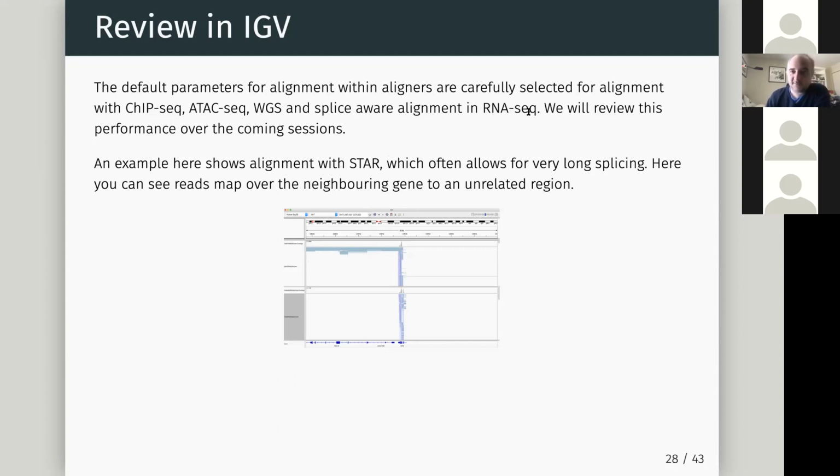So we could probably look a little bit more at this, in comparisons. But in this case, what we would say is that these 200 reads, we wouldn't count them anyway, because we're not sure what gene they belong to. So they get thrown away at a later point. And that's really what that paper I point to is going to say. It's going to say Subread is doing a great job of accurately measuring your gene expression.